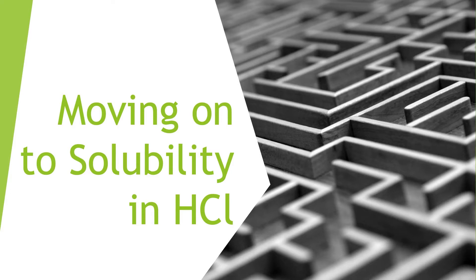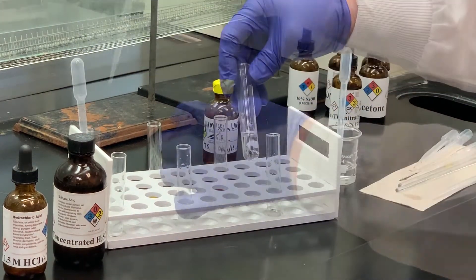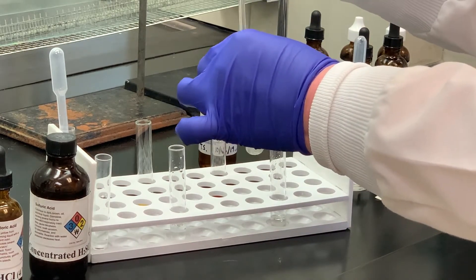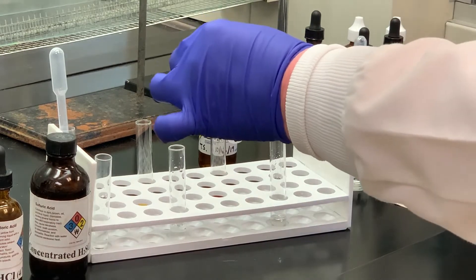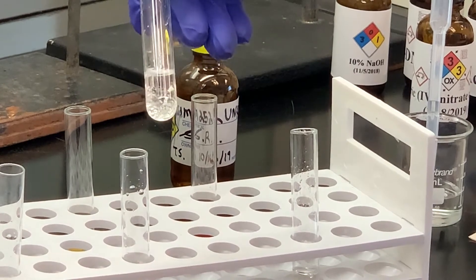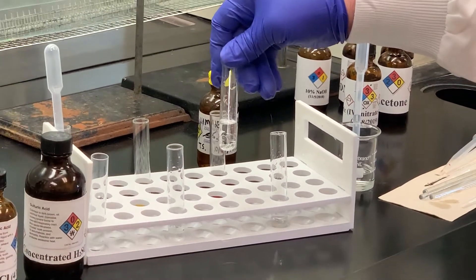So now we have to move to the hydrochloric acid solution. I've got some hydrochloric acid here and I'm going to add some of my unknown to that. I probably wouldn't shake these a lot without some type of stopper since they're caustic acids and bases — I would use a stirring rod instead. You can see the unknown is forming oil droplets at the bottom. So again, we know it's not soluble in hydrochloric acid.